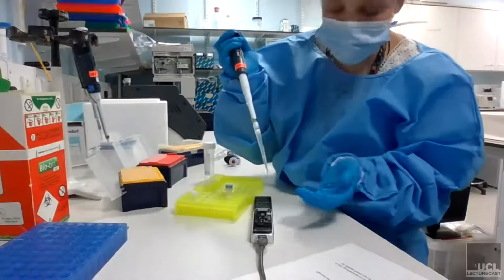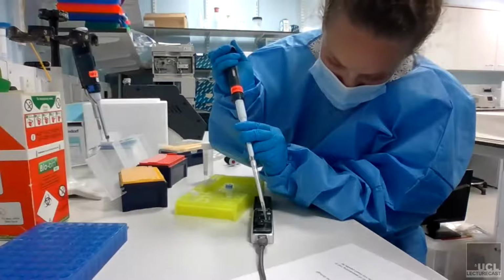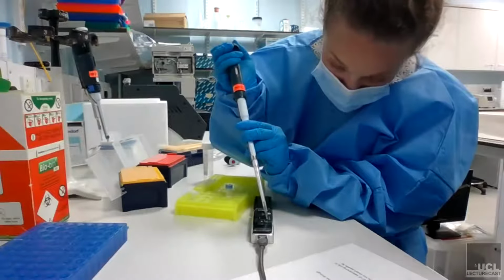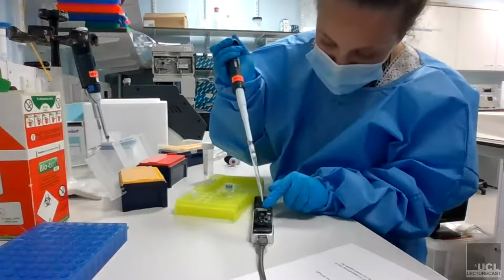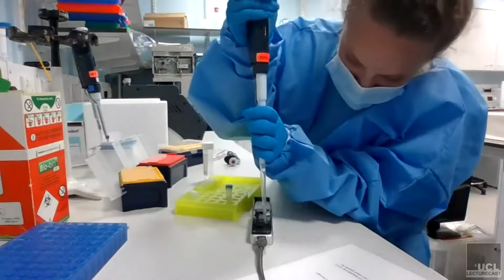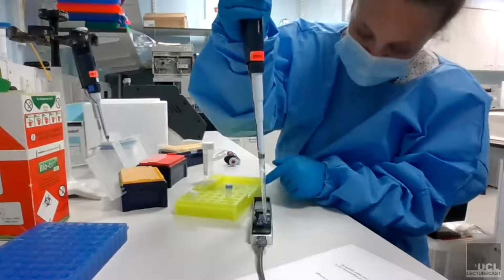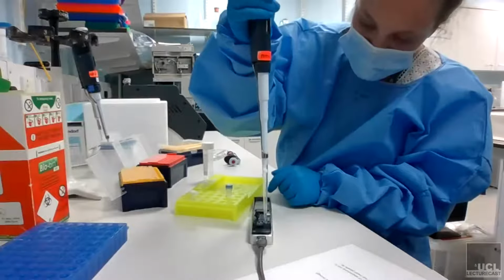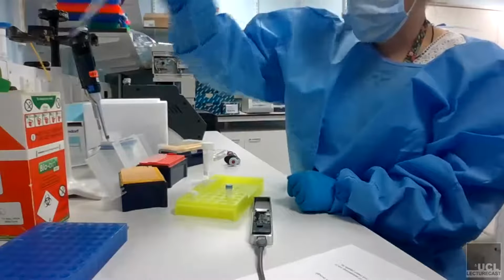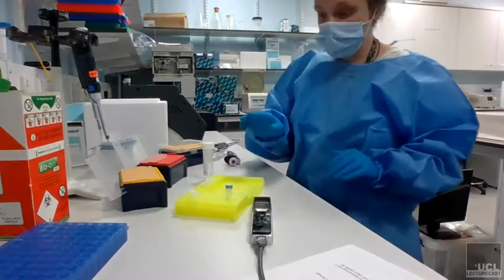Now that I've opened this hole, it's almost like a vacuum. It's liquid, but it's a vacuum. So you'll see, if I put this on, it should start to suck it through. Generally it starts to suck, and when we put the sample on, it will suck it across. I'm just going to add the rest of that, and you see it starts to come out of the hole, and it will suck it back in again. So that's the flow cell primed and ready to go.